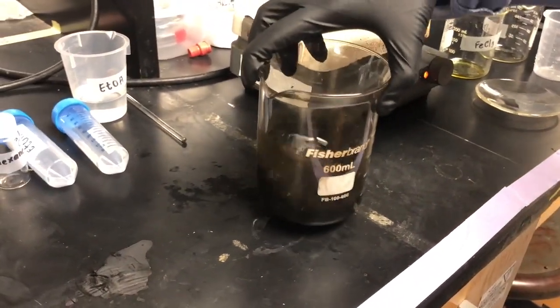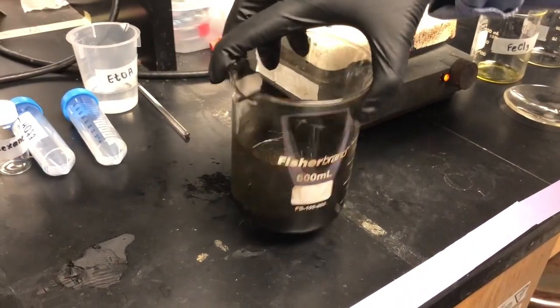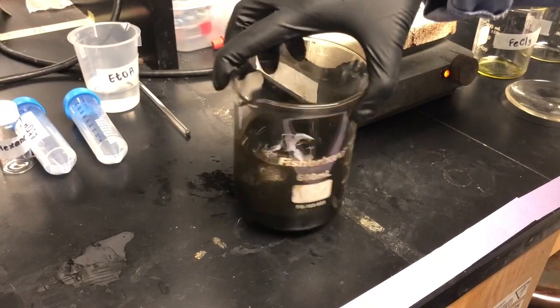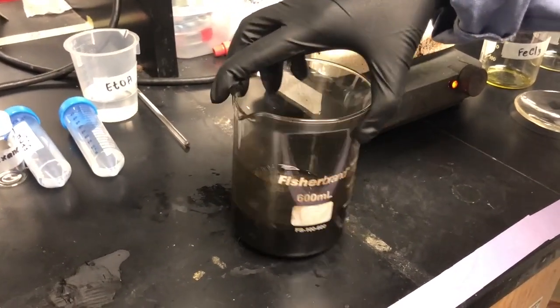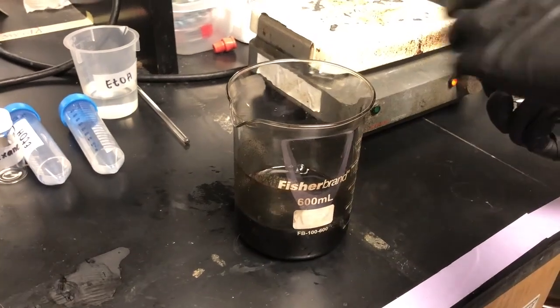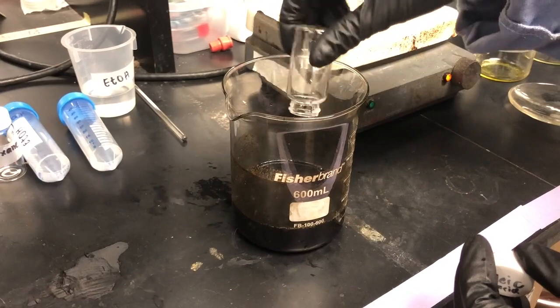And so next we're going to give that a swirl for a few seconds, about 30 seconds or so. And once those are fully reacted with the ammonium hydroxide, we'll add in that oleic acid. You can just pour in the oleic acid, give that a nice swirl.